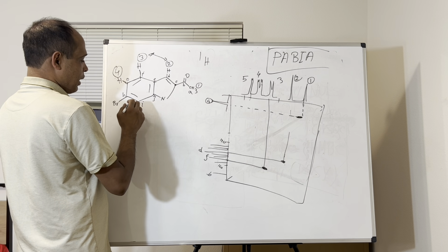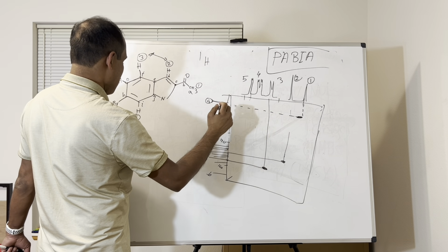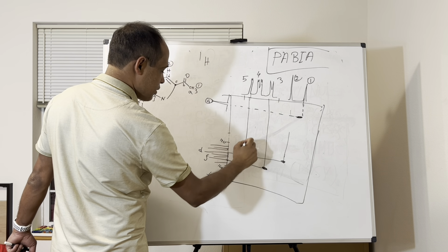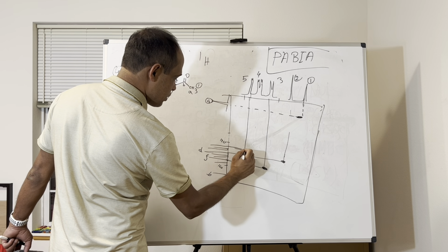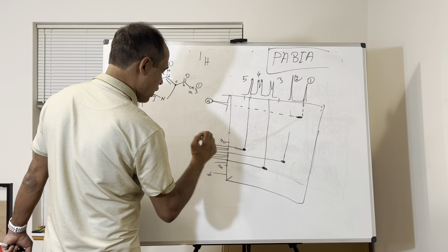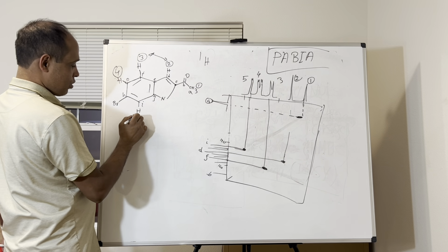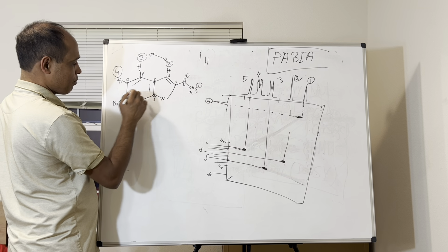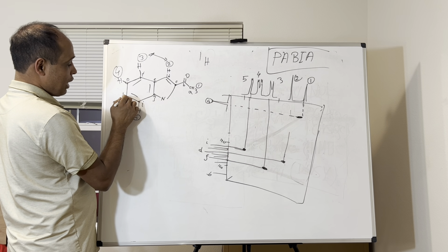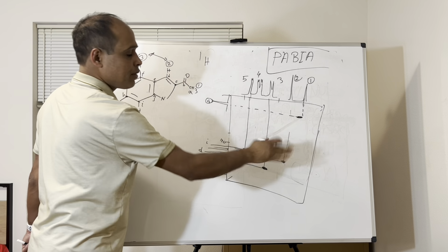Okay, and I has a proton. So which one was the I? Number 5, right? If you see a peak here and it is matching, you can say, okay, this is the I carbon, like 5. So proton number is 5 and carbon is I. This is carbon, remember that. Okay, the H carbon doesn't have any proton, so you will not see any cross peak here.